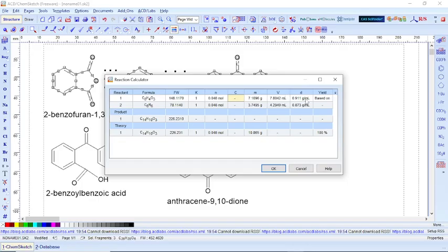Okay, it means it's not giving me what I want. I want to show you something else that could probably give us a clue of what you are asking. Let me say volume is 50 mil.